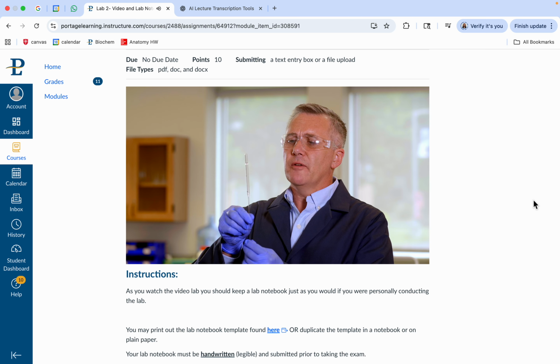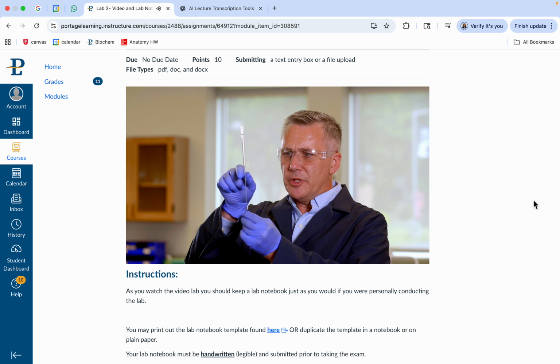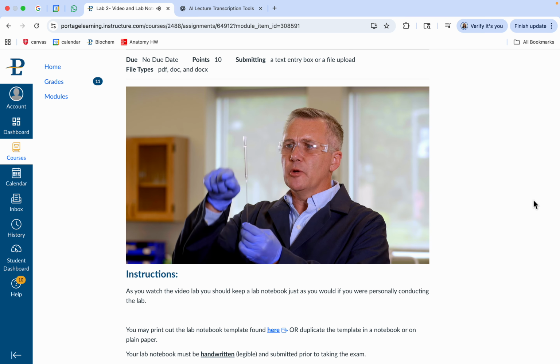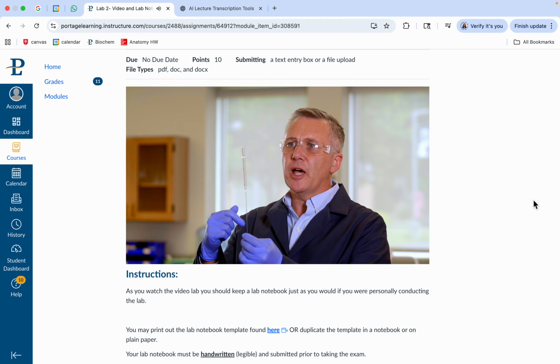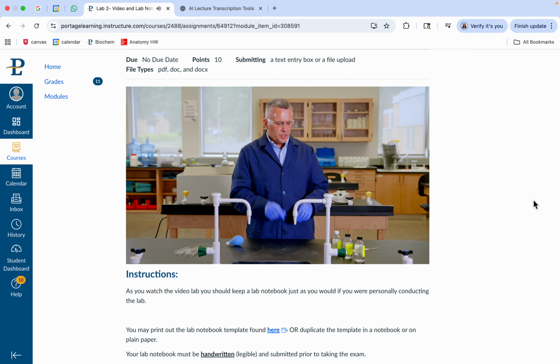All right, so what we're going to do is use flow through a capillary tube with small tubes. We're going to use this pipette with this narrow part as our flow. We're going to watch as a couple of liquids go from this mark to this mark, which is 4 centimeters apart. I've already marked it, and we're going to measure the time that it takes for it to flow 4 centimeters. We're going to do this for a couple of different compounds.